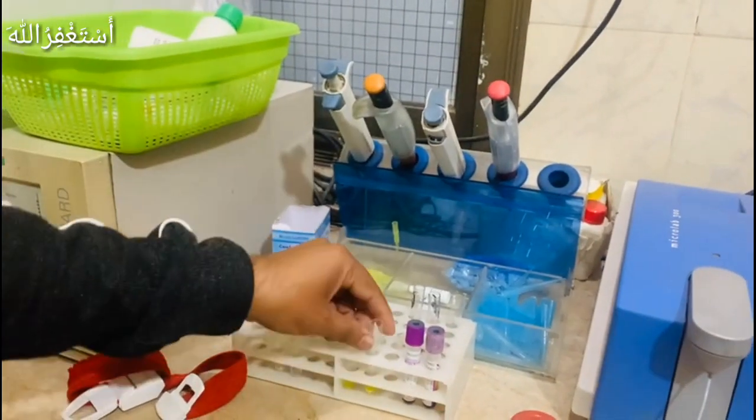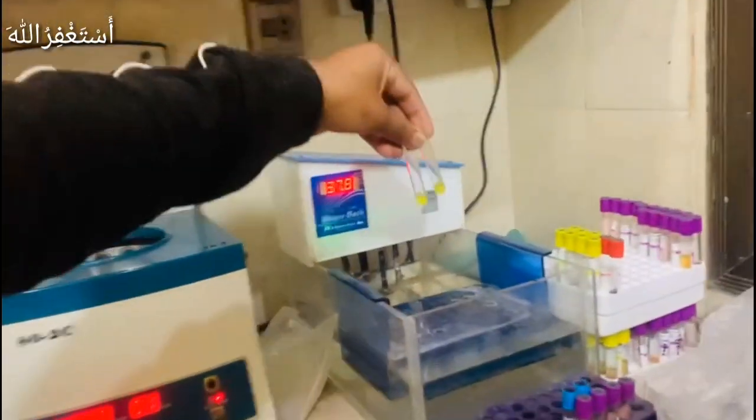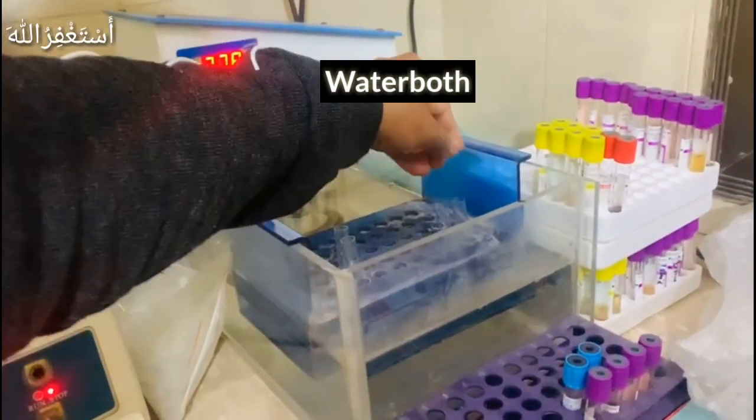Now we will place the tubes in the water bath at 37 degrees for one minute. This is the water bath.